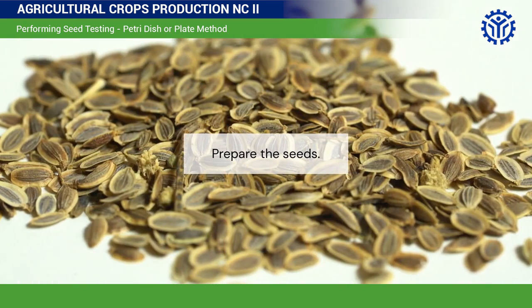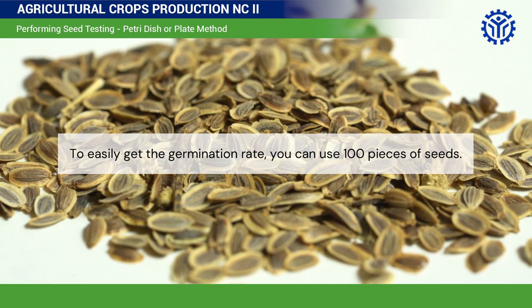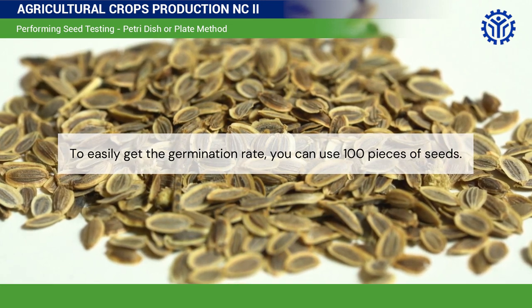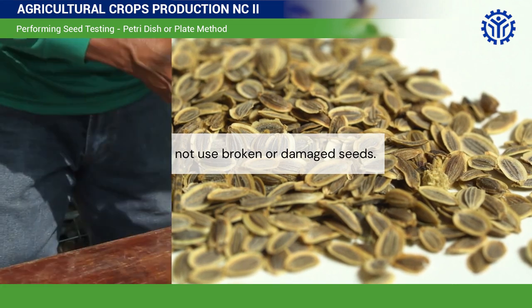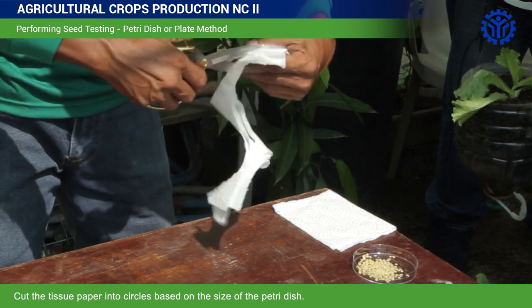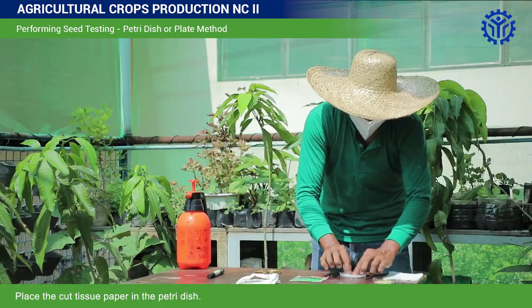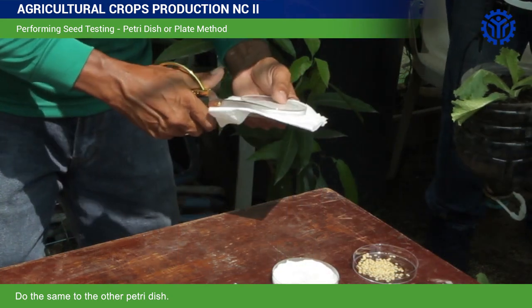First, prepare the seeds. To easily get the germination rate, you can use 100 pieces of seeds. Do not use broken or damaged seeds. Cut the tissue paper into circles based on the size of the Petri dish. Place the cut tissue paper in the Petri dish and do the same to the other Petri dish.